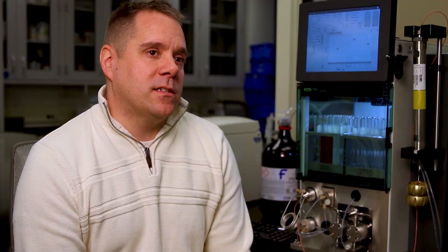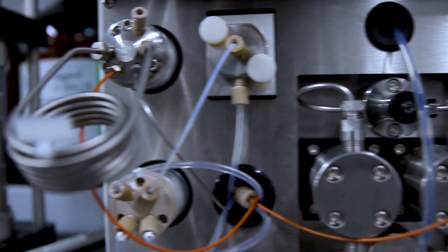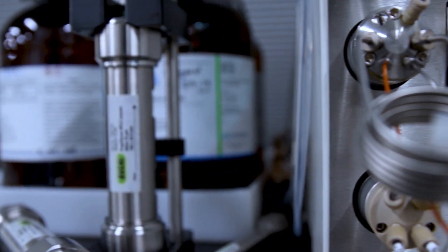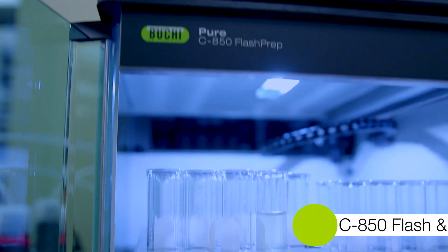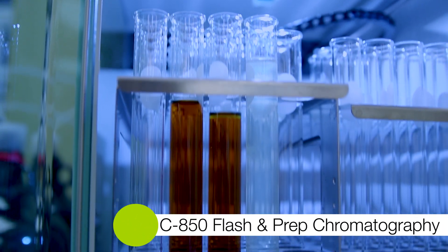The other instrument we have in the laboratory is the C-850, which is basically a flash prep system. For us, it's been really helpful for being able to isolate out the natural products that we're working with. We can run this in different modes, whether it's flash or prep mode, and that really depends on whether we're looking for high purity or larger volumes.